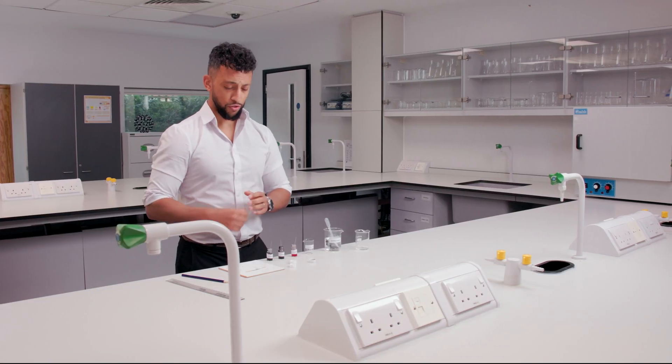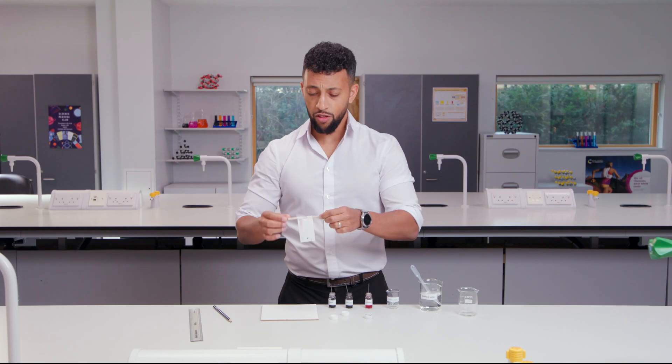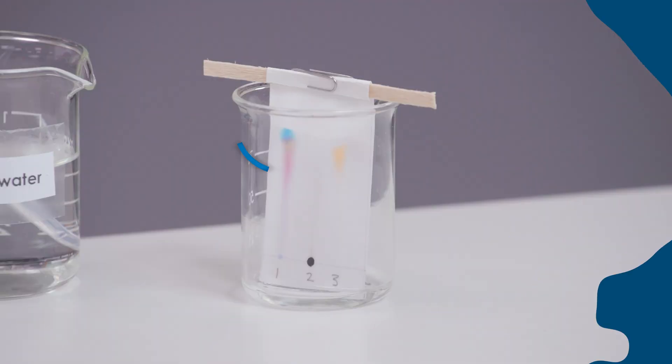Let's look at the results. The black ink in sample one contained blue, orange and pink. It is impure.